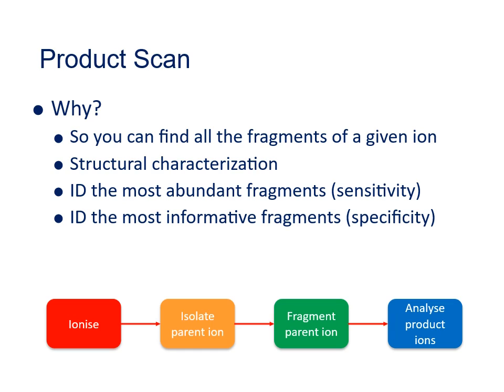And then we'll come back to how we use the information about the most abundant or most informative fragments when we look at the selected reaction monitoring mode later.